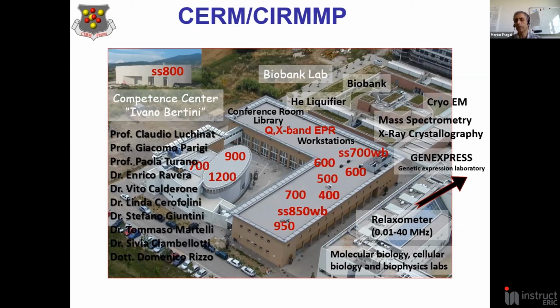But obviously, I think that degradation is a process that can occur in this system. For the moment, we have not investigated this aspect, and we have not observed it. What we have observed sometimes is that you obtain terrible spectra, if, for example, the hydration is not enough, or the sample conditions are not good.